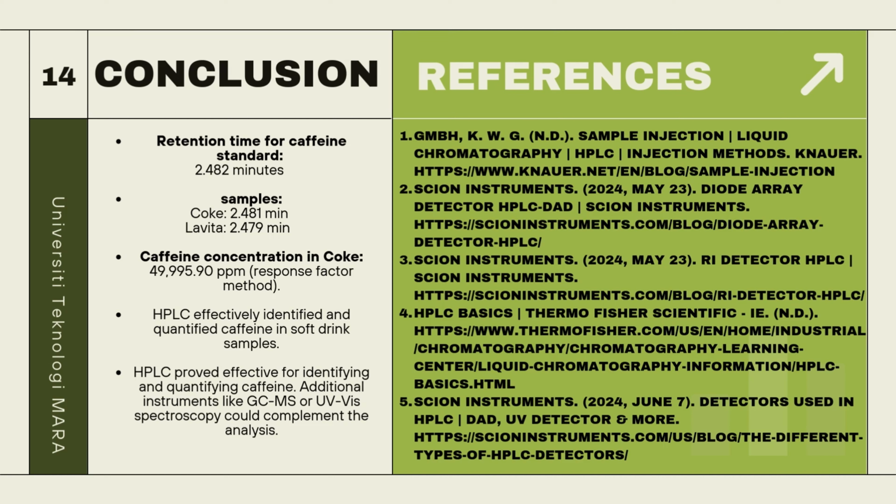Using the response factor method, the concentration of caffeine in Coke was calculated as approximately 49,995.90 ppm. The results align with the objectives of the study by demonstrating the capability of high-performance liquid chromatography (HPLC) to accurately determine retention times, identify compounds, and quantify caffeine in soft drinks.